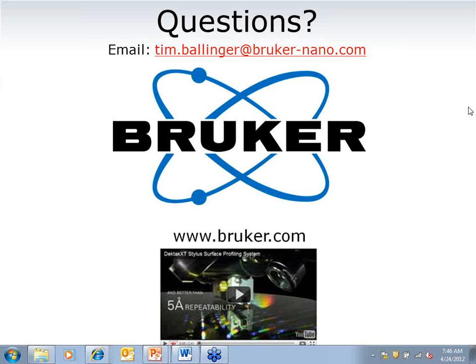That's a great question. The SA is a parameter that is just recently becoming more and more popular. In the past, everyone focused primarily just on RA because they were using 2D profilers. Now, with the advent of 3D measurements, more and more people are wanting to look at RA over an area as opposed to just a single profile. So RA is a calculation that's derived by just looking at a single profile. The RA that was shown in that slide was just looking at the profile in one direction and getting an average over all those profiles. Now SA is a new parameter that's looking at the area over a surface as opposed to just a profile. As I mentioned, optical profilers can generate very fast 3D images, so SA is becoming much more prevalent and popular.